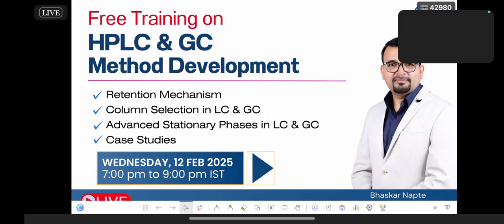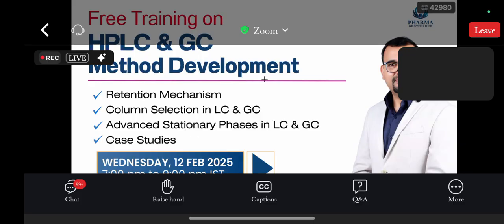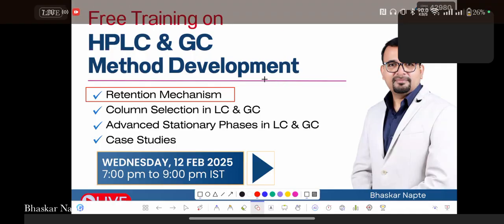And let us now understand the points we will be discussing in today's webinar. First and foremost, we'll talk about retention mechanisms both in HPLC and gas. This is one of the very important topics of today's. And very interestingly, we will be talking about both liquid and gas chromatography together in today's webinar.